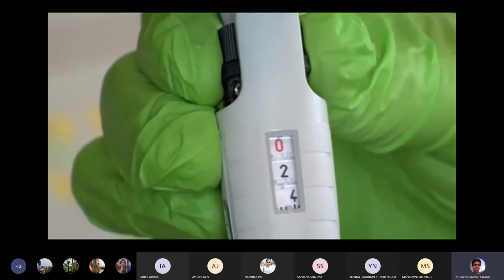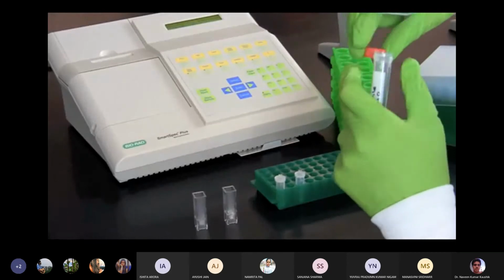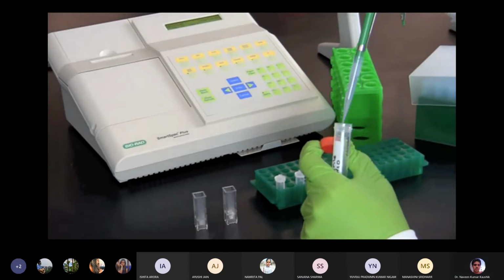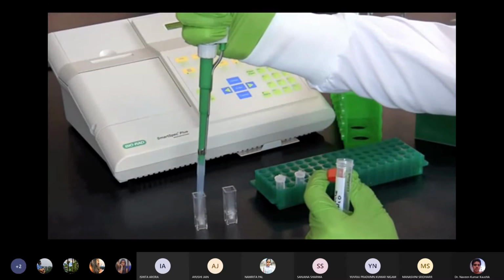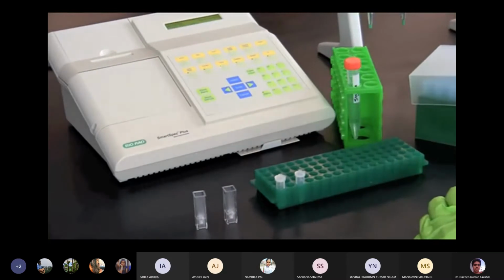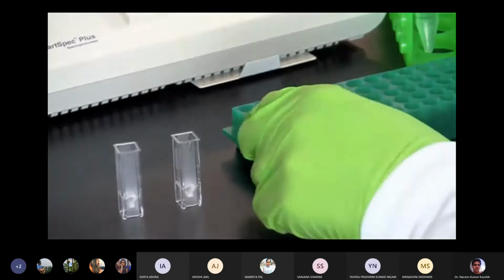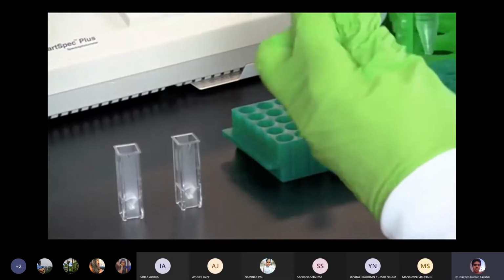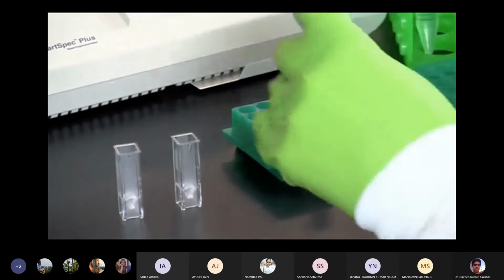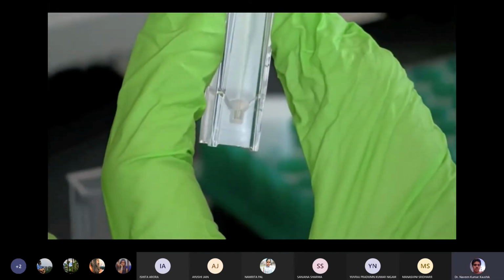Set your micropipette to 245 microliters. Pipette 245 microliters of distilled water into both cuvettes. Set your micropipette to 5 microliters. Pipette 5 microliters of purified DNA sample into the test cuvette. Pipette up and down to mix the sample.